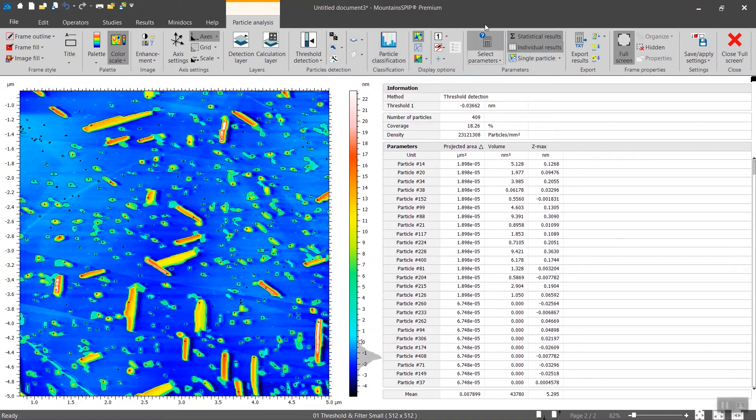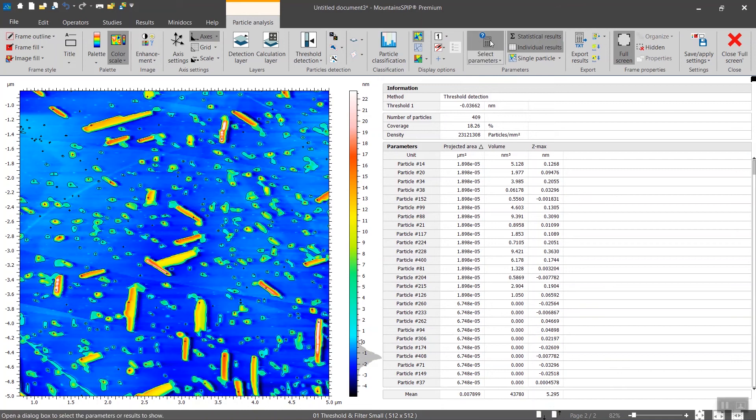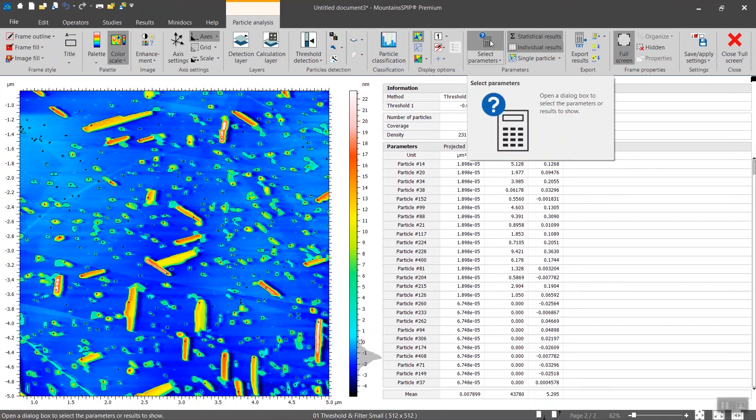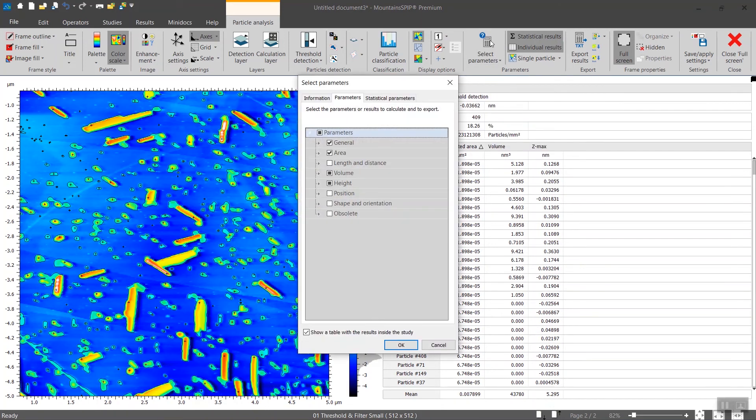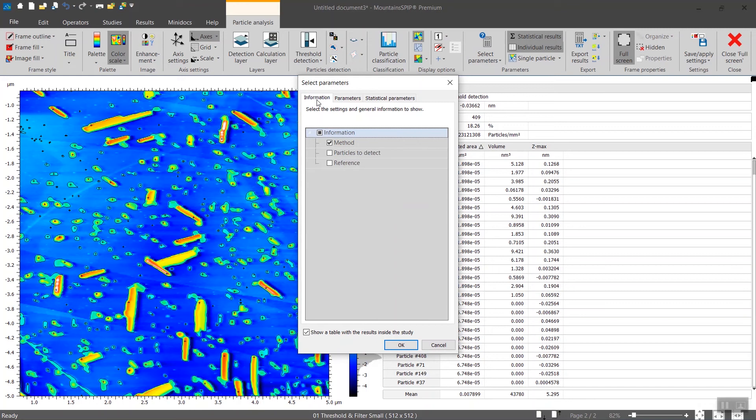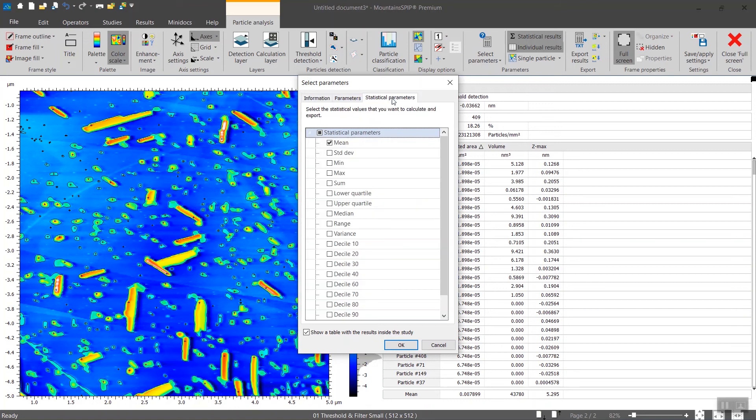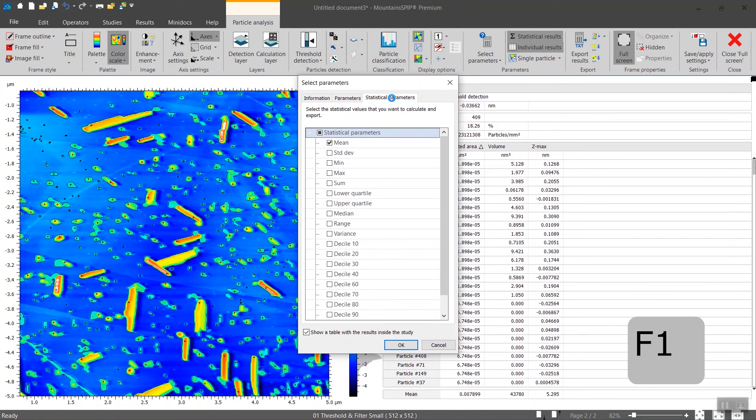Very important, here you can select the parameters. So remember, by either double clicking on the table or directly here, you have the information, you know which particles to detect, then you can also change or add statistical parameters. If you want to have a full description of all the parameters that we provide, you press simply F1.